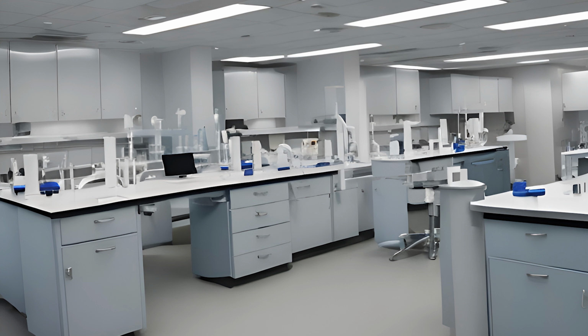Other labs will provide inspectors to come inspect your lab. CAP will give them a checklist of items they're looking for, and other laboratory scientists, other people who work in the lab at a different lab, will come and inspect your lab because they're the people that know what they're doing and know what they're looking for. It is a peer-to-peer inspection system where we inspect each other and hold each other accountable.